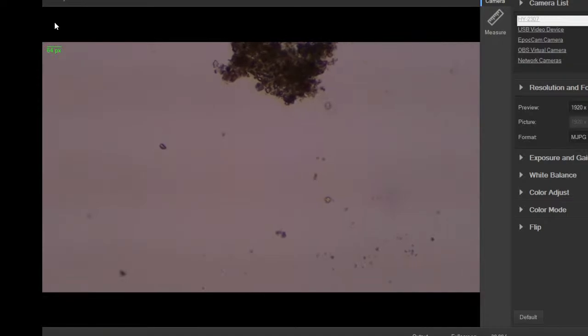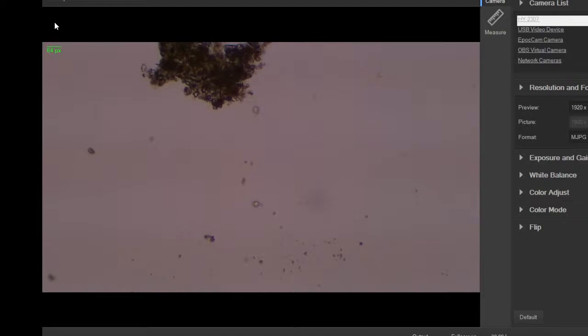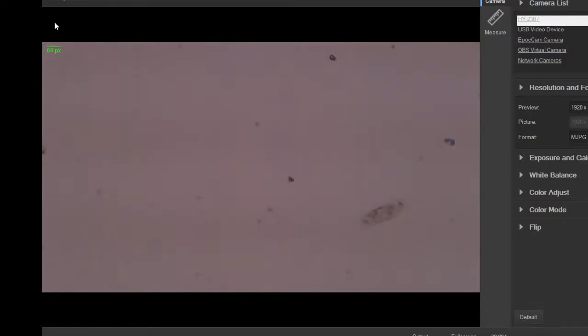Oh, it's very flexible. You can see it bend around that material. That's pretty cool. It's like going through things, bending around things, and then kind of spinning too. You can see the flatness when it spins along its axis.